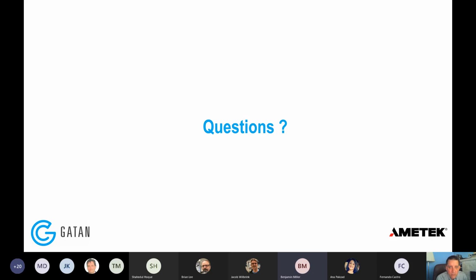Yeah, but it's a good question, and it's a good answer, because it demonstrates the point about something you couldn't do or wouldn't have necessarily thought of in the past. You write a modest, I would say, script in Python, and you can get some wonderful quick analysis. And if it's something that the community needs and wants and uses, just like the live FFT is baked into Digital Micrograph, that's certainly something that we appreciate the feedback on.